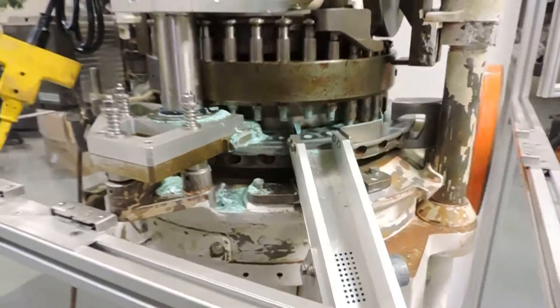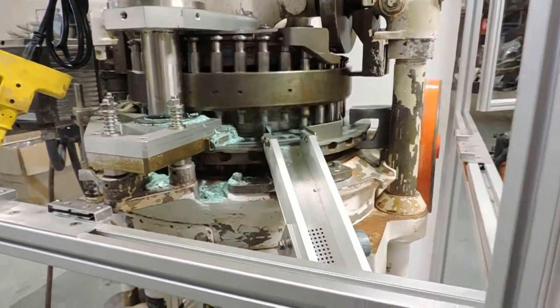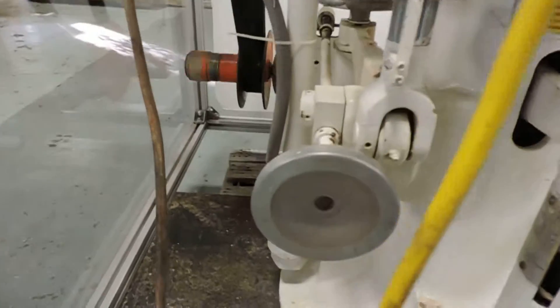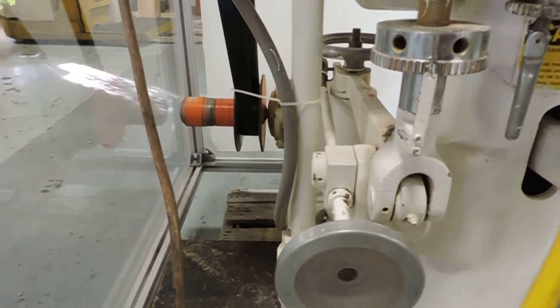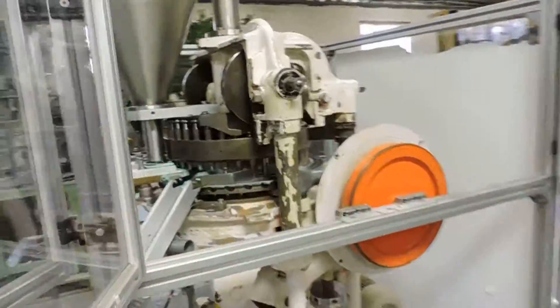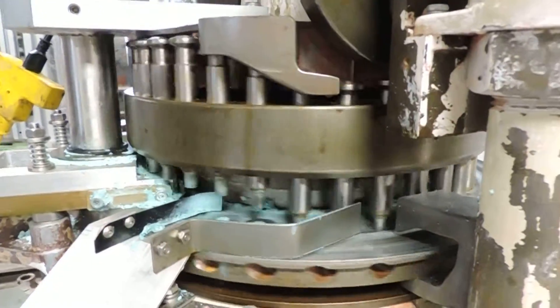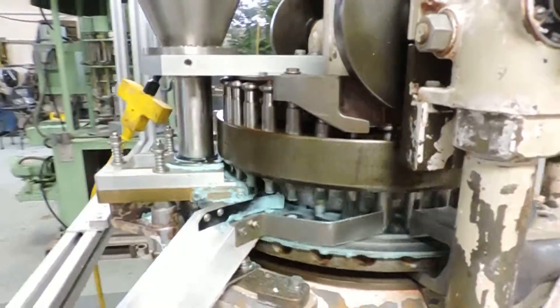Most of the existing tooling is from Stokes. As you can see, it has the adjustable speed drive, which is the standard variable speed pulley. We're operating on 220 3-phase voltage right now. It has an upper keyed head as well.